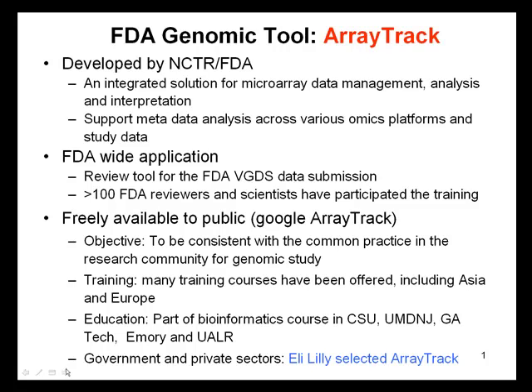Good morning. Today I'll be giving a brief overview of the FDA genomic tool ArrayTrack. ArrayTrack has been developed at NCTR as an integrated solution for microarray data management, analysis, and interpretation. Apart from microarray data, ArrayTrack also allows for integration of data from other omics platforms and also incorporates study data from both clinical and non-clinical studies.